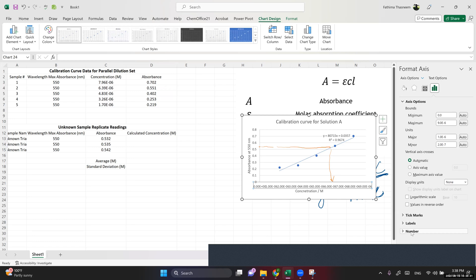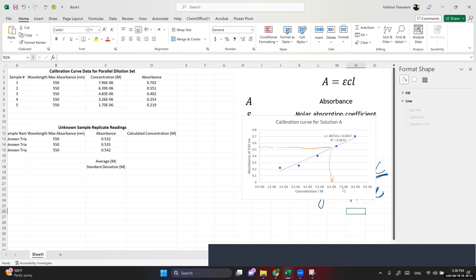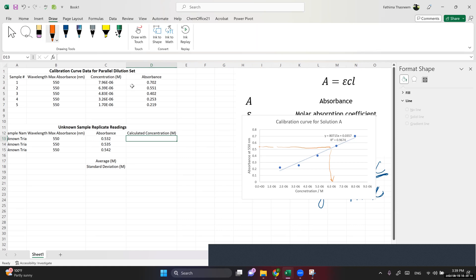The concentration axis is crowded, so I double-click it, go to Number on the right side, set it to Scientific with zero decimal places — now it's much clearer. To solve for x in Excel, rearranging y equals mx plus c gives: x equals (y minus 0.0357) divided by 80,715. So you take the absorbance value, subtract the intercept, and divide by the slope.